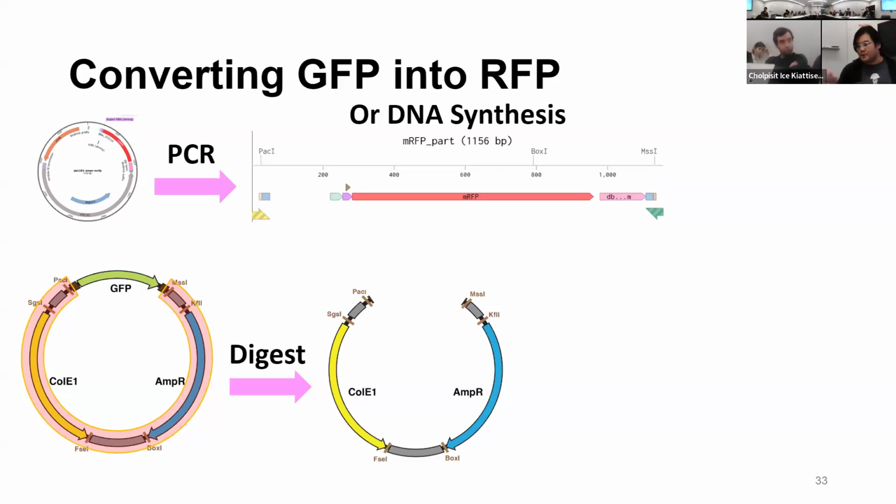So in Benchling, they will tell you what DNA sequence the enzyme recognizes, that it is restricted to cutting. On the tools, which I'm going to show you in the next few minutes, they will have the pattern. Let's say they could be 6 base or 8 base, the recognition sequence for the enzyme to go and cut. So if you wonder where they can cut, Benchling is one of the tools that can show you where the cutting spot would be. Very good question.